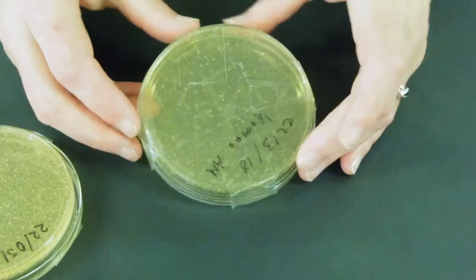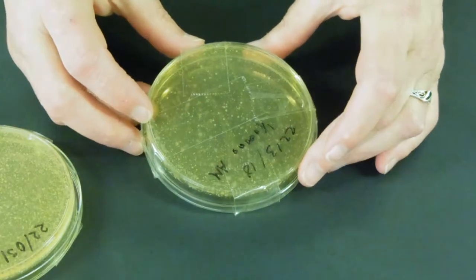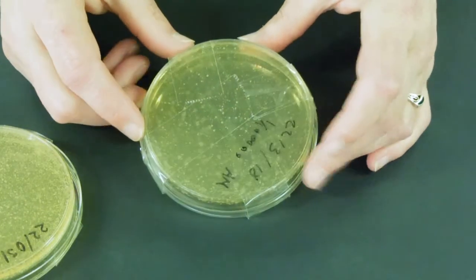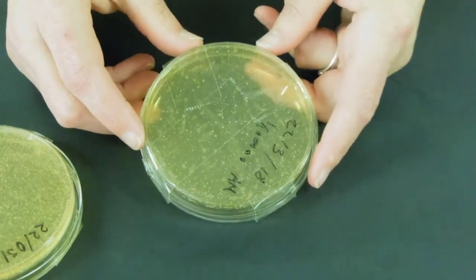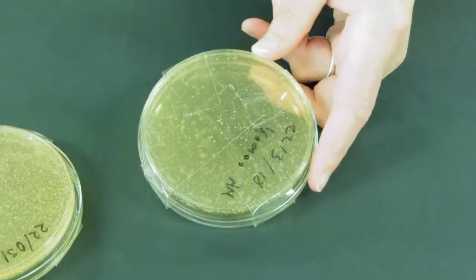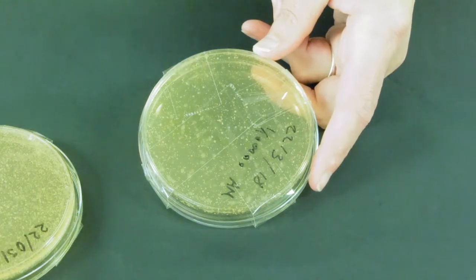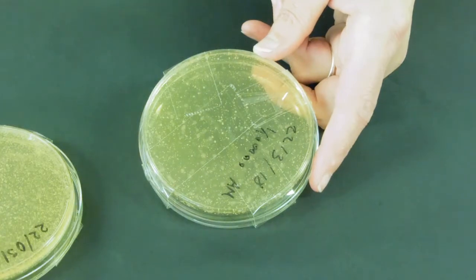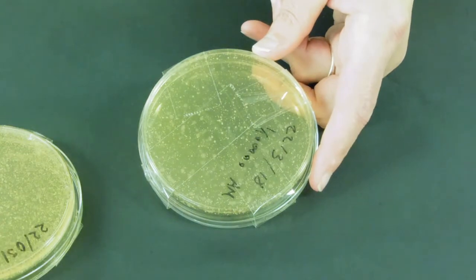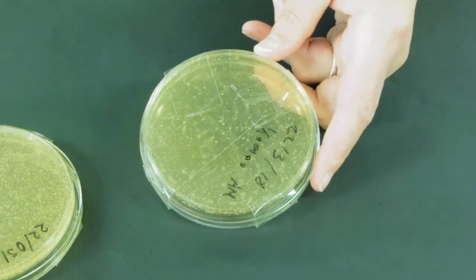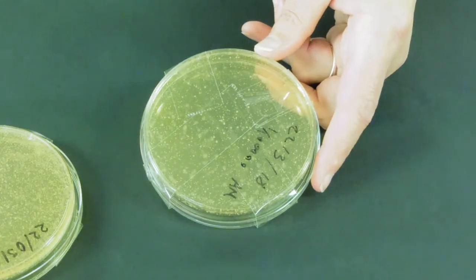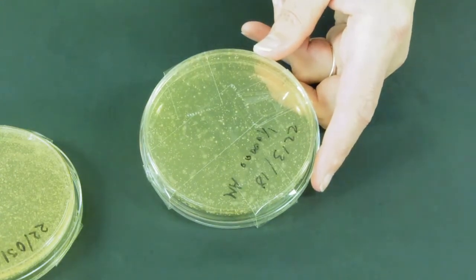So this is the one that we would count, and probably there are still a lot of them, so it's going to give us a nice representative sample. The colonies are spread evenly throughout the plate. You probably, if you're going to count them, need a fine sharpie pen and a little tally counter clicker to do it with. You may even choose to count a quarter of the plate and multiply up because there are so many colonies. If we'd gone to another dilution and done one in a million, those would have been even more spread out, but we may not have then had a representative sample.